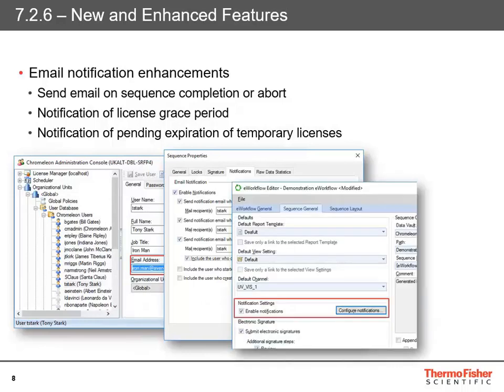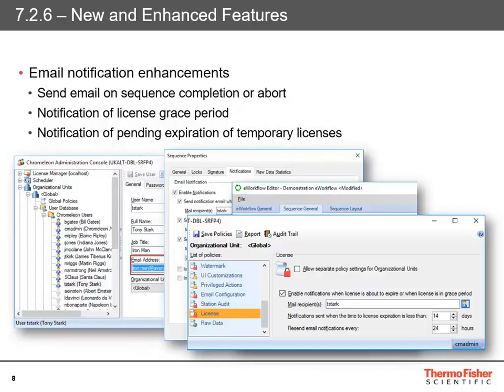As part of the e-workflow editor, this is also accessible. Clicking 'enable notifications' and then 'configure notifications' brings up the same options to send notifications as part of your e-workflow, so when it creates a sequence it will automatically put those notifications in. You can also now get notification if your license is expiring or is in the grace period — if it's gone into NFP mode and is about to run out, you can get a notification to remind you to update your license.